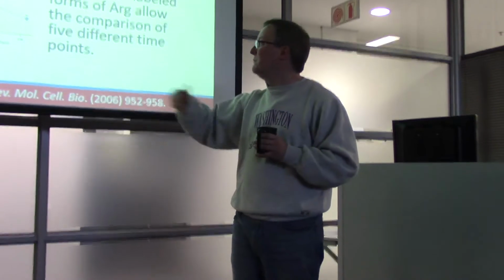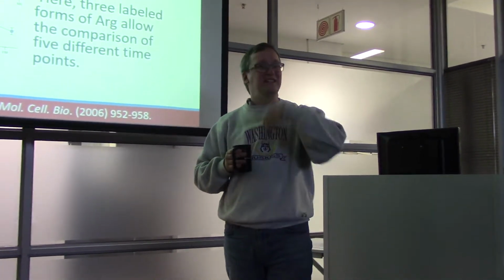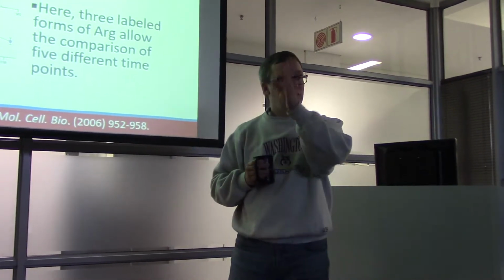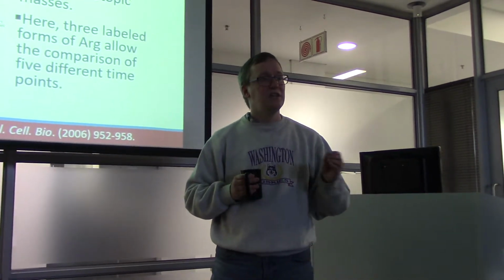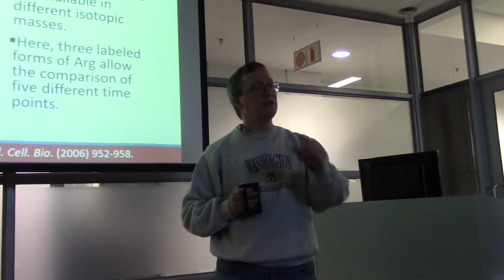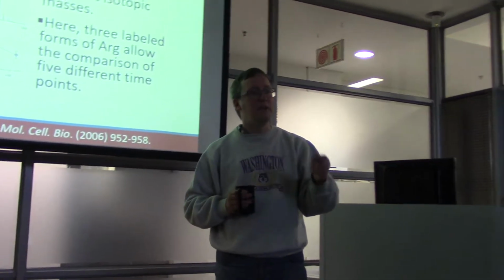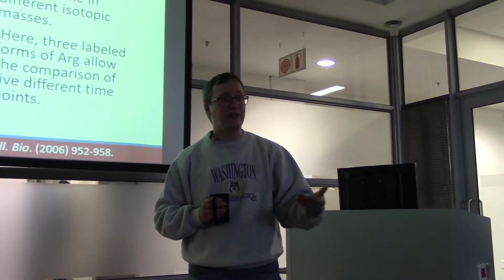We also have medium versions of these. This gives you the ability to combine together data from multiple time points if each of these different labels represents a different time point in your experiment, to do one proteomics experiment that combines together data from multiple time points. Then you can keep track of how much signal comes from each of these cohorts based on which mass to charge value you're getting what chromatographic intensity.